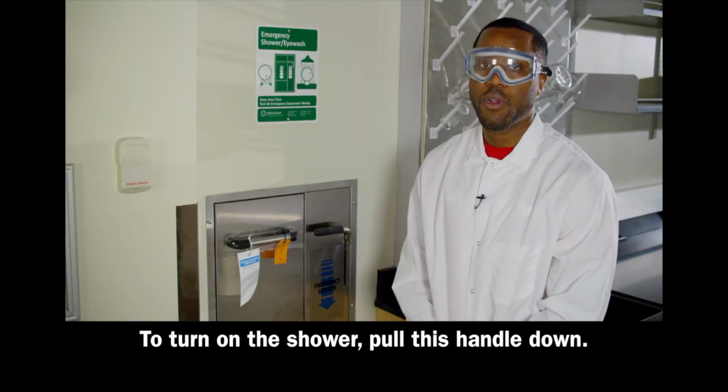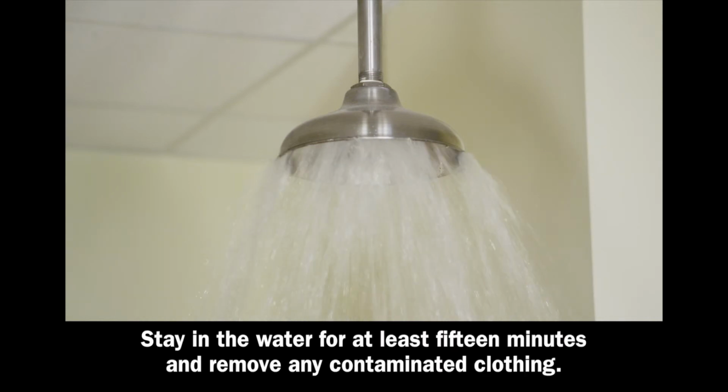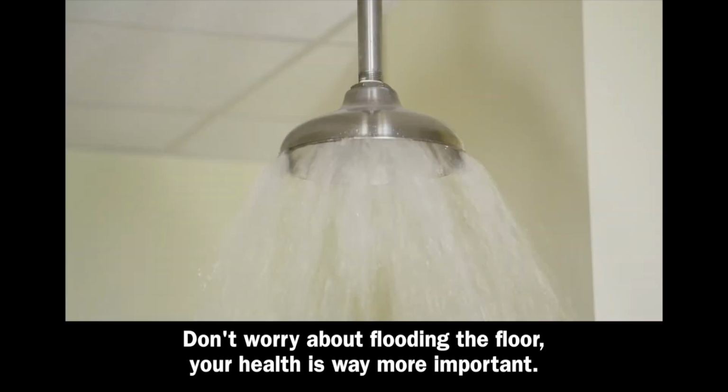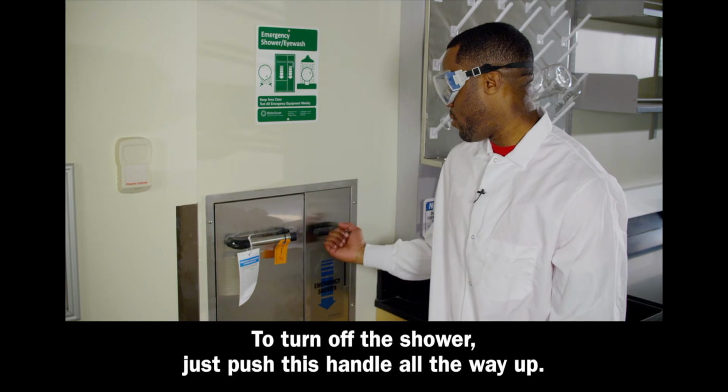To turn on the shower, pull this handle down. Stay in the water for at least 15 minutes and remove any contaminated clothing. Don't worry about flooding the floor, your health is way more important. To turn off the shower, just push this handle all the way up.